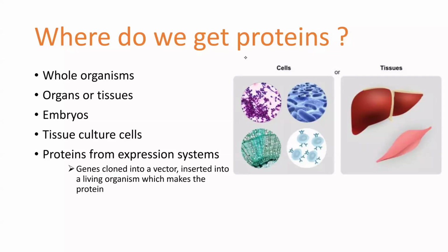Assuming now you want to get spike proteins. And of course, you know that the spike protein is the protein usually found on coronavirus. So you can't just say, okay, I want to go to the liver tissue and get spike protein. It's not possible. So you need to set your target. You need to know your target.